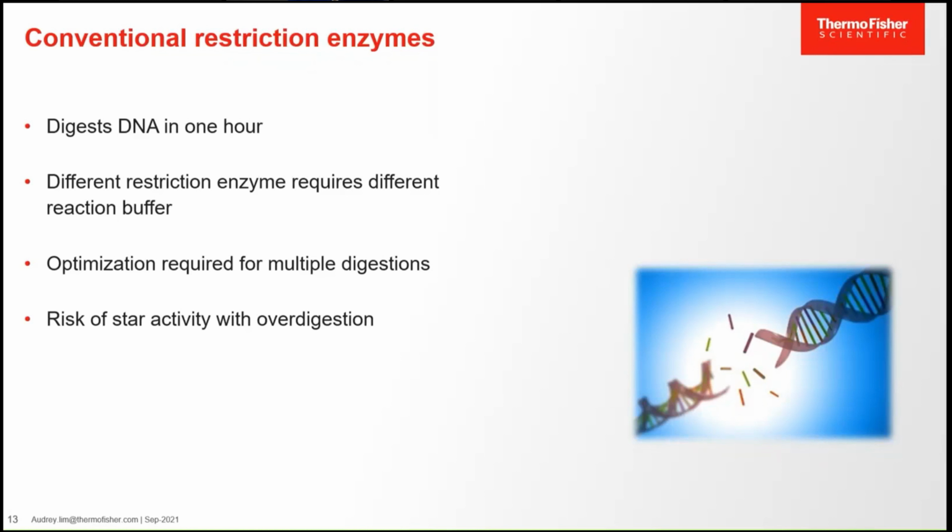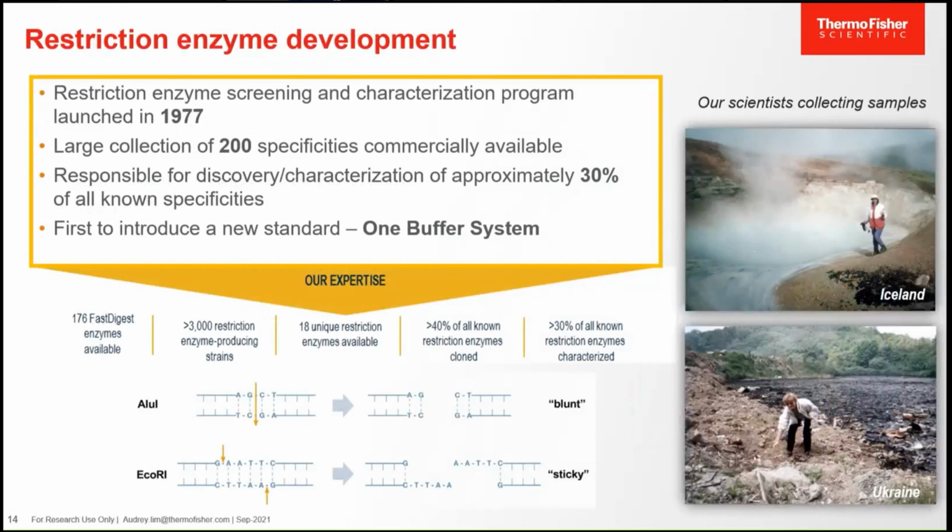Because of the long digestion time, there is also a risk of star activity, which refers to non-specific cleavage of the DNA outside the restriction site. Okay, so here is just to share.